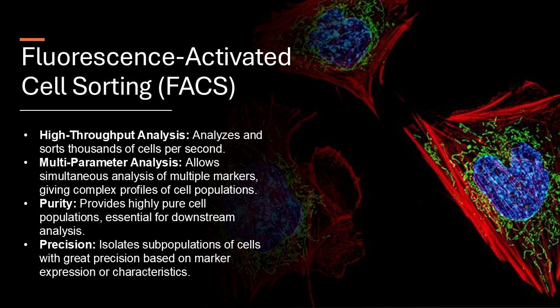So instead of just seeing red, green, and blue, we're seeing the whole rainbow of fluorescence. Yeah. You could say that this increased resolution gives us a better picture of cellular complexity and lets us identify those rare cell populations that might have been missed with traditional FACS. Impressive. I can only imagine what we'll be able to learn about cells as this technology keeps improving.